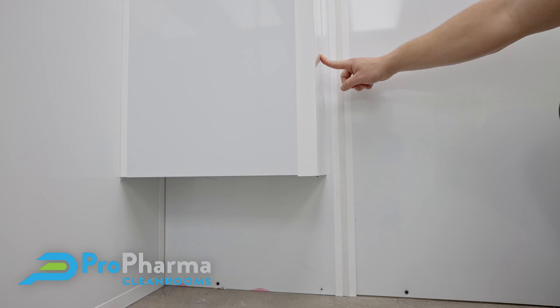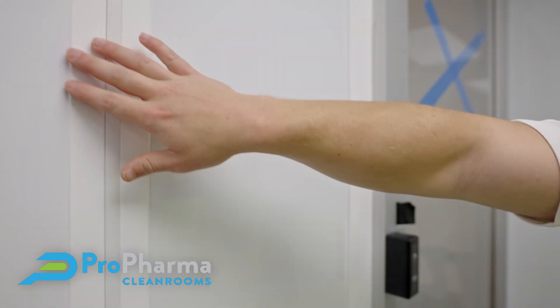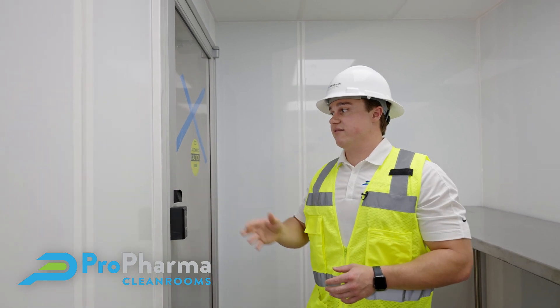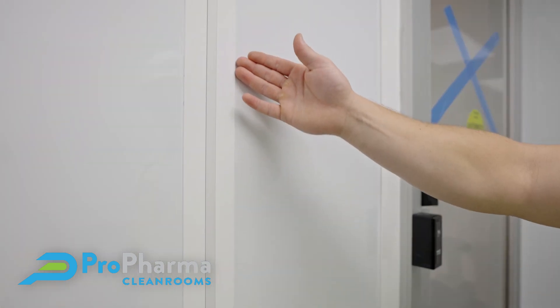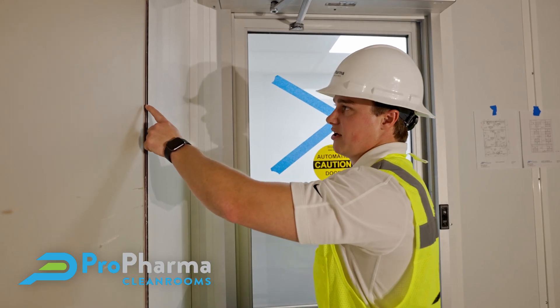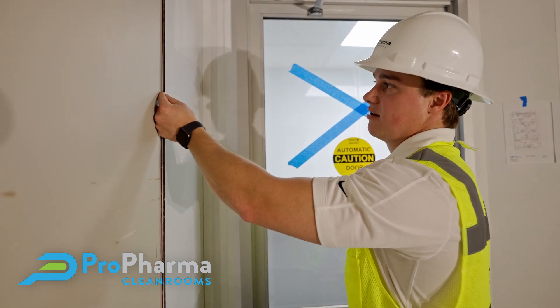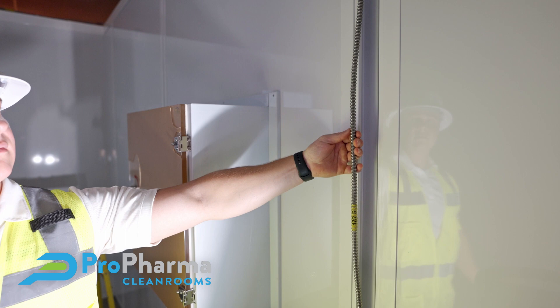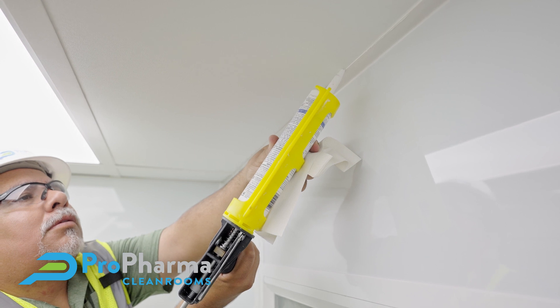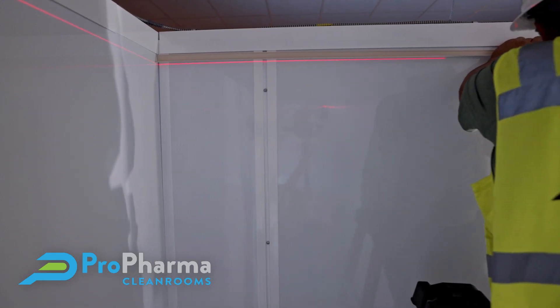The air is recycled and sent back into the room. You can really notice the level of detail we put into this caulking — it's 100% silicone. The reason is that when the end user is occupying this space, they're required per USP to follow a very stringent cleaning protocol involving harsh chemicals. We have determined that the silicone we use can last up to 17 years against those harsh chemicals. We're known for coming into very complex environments with a lot of limitations and working hand in hand with the general contractor, architect, or end user to develop a functional facility that meets the needs of the pharmacy staff and ultimately the patient.